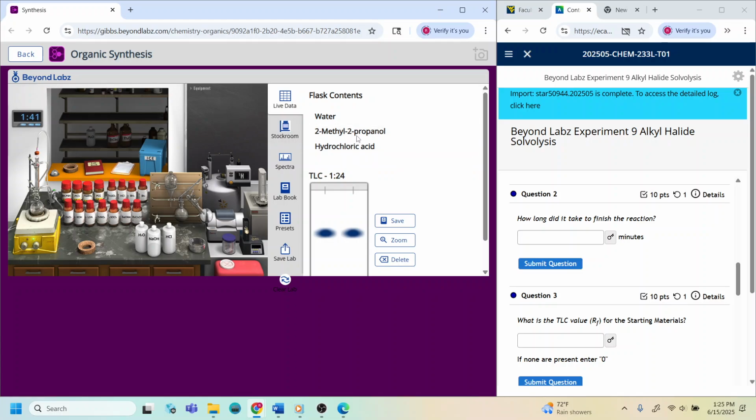Now what I need to do is purify it, and the purification comes by either extraction or crystallization. We do crystallization if our product is a solid, but here our product is a liquid. So we're going to do extraction. This is how we're going to purify it. See that separatory funnel, this is the extraction in there. We're just going to take the separatory funnel and let it touch the flask. By doing this, the contents in the flask will transfer into the separatory funnel.